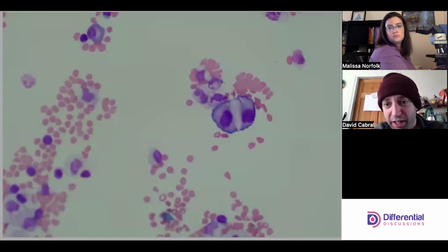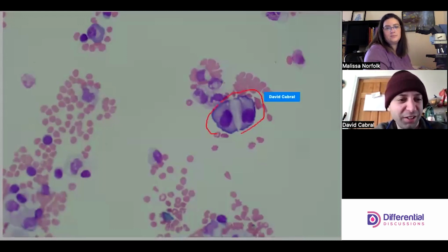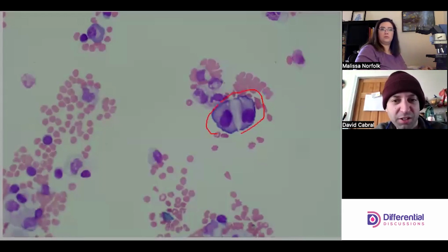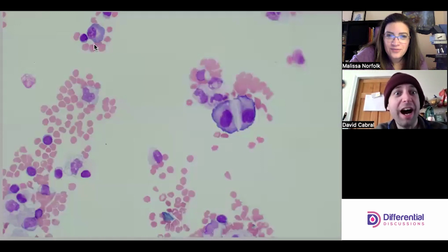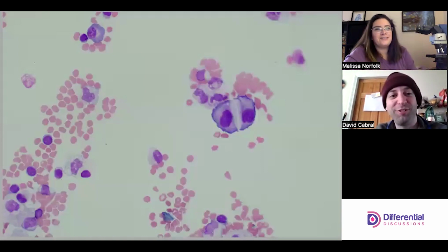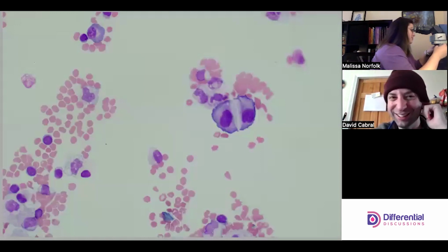Really pretty. I like that dark blue ring. A little bit weird. Look, there's a plasma cell. Wow, beautiful. Good eye. Very good eye. That excited me more than these lungs. Let me drop down so we can see them closer.